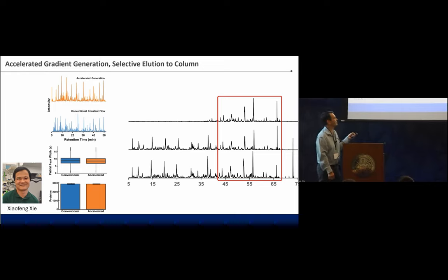I think, not too long ago, there were no sub 75 micron columns commercially available. Now those are starting to show up. And so I think if the motivation is there, it's a little bit of work to set up that multi-column system, but then it just runs and runs and runs. The only thing that limits us from keeping it running forever is we don't have an infinite number of LC systems. So when we want to do something new, we have to cannibalize it and use the parts for the next thing.